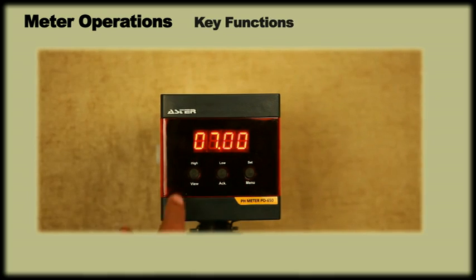The view key displays factory settings of relay like high on, high off, low on, low off, temperature and output settings if any.